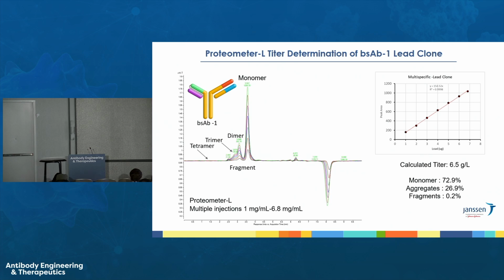And actually, the aggregate content in their samples was as high as 35%. And we have tested from less than 1%. In some of our samples, it works. So 1% to 35% seems to be a big range, and it still works.